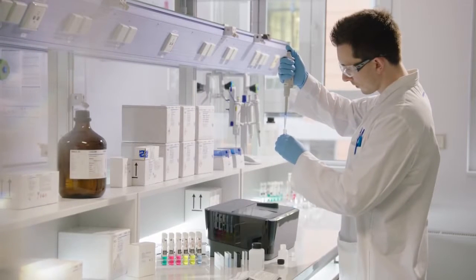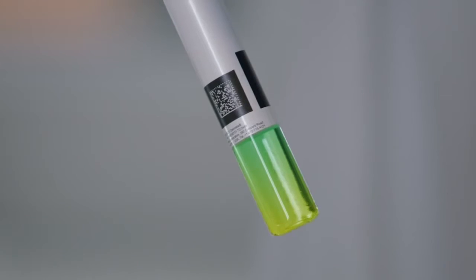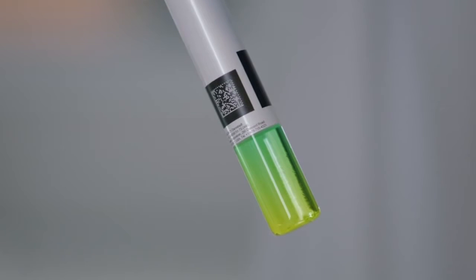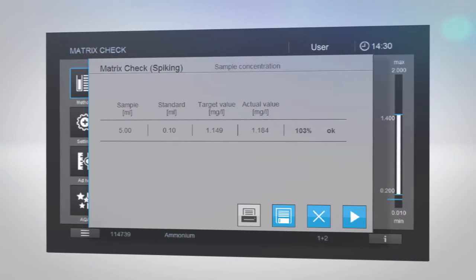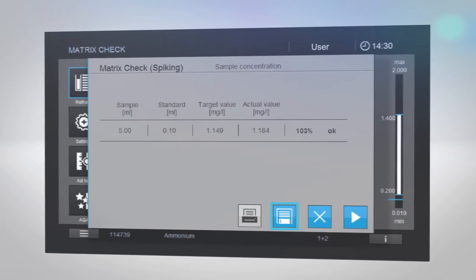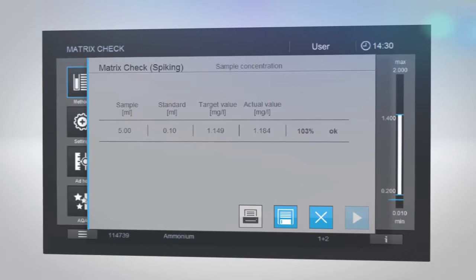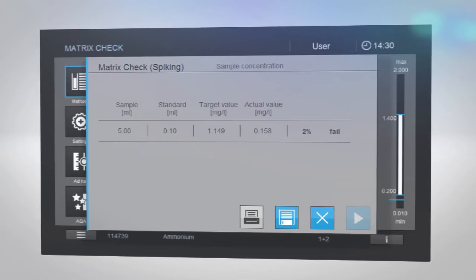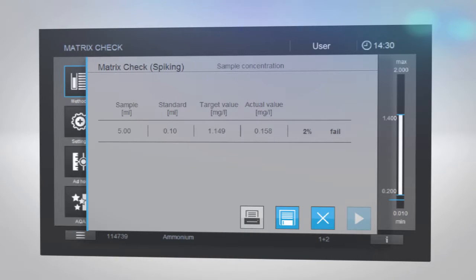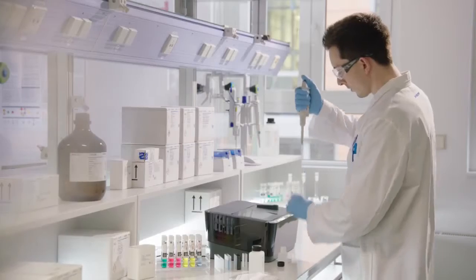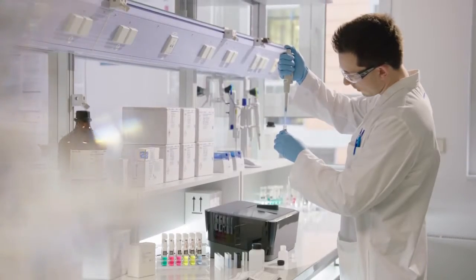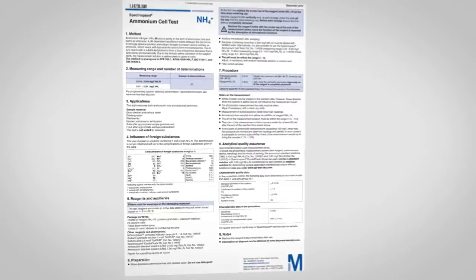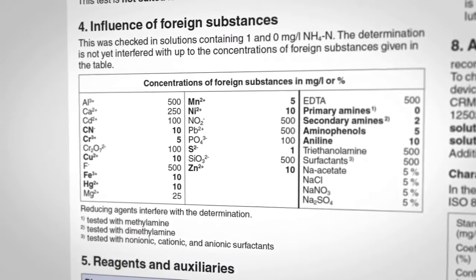Alternatively, you can perform a Matrix Check using your own standards. When doing so, adapt the number of dilutions or additions to your needs. If your result is within the range of the Matrix Check, you have no interferences in your matrix, and your original result shows the correct amount of sample you measured. However, if your Matrix Check is out of range, your original result may not be correct due to interferences in your matrix. Please check your sample preparation routine for adaptations to eliminate or reduce possible interferences. We also recommend that you refer to the package insert for additional information about possible interfering substances.